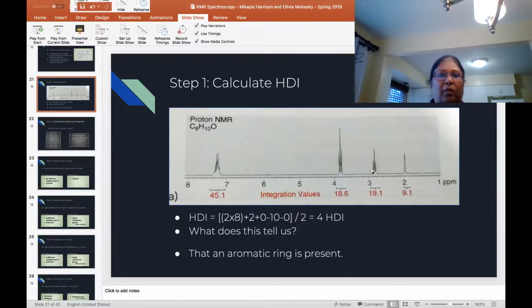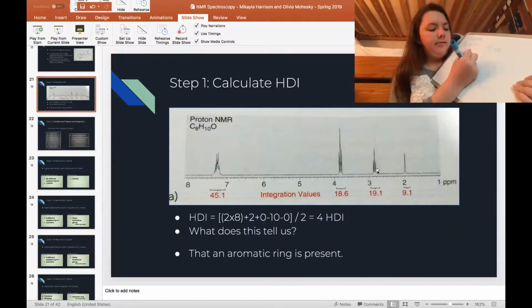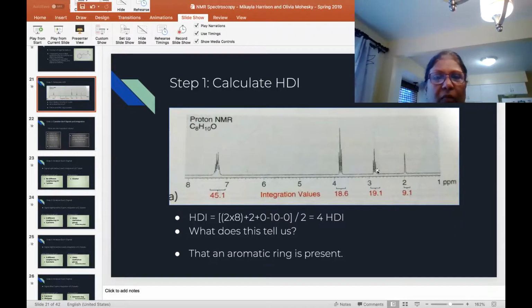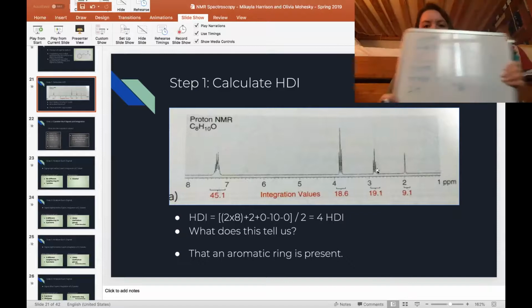Yep. Now, what do you think that is? Possibly a CH2, right? Mm-hmm. Yeah. So with that, what I would do is I would just draw out like CH. Man, this marker's running out. So I'm looking like, here's my fragment. This squiggly line just means it connects to something else. So I know that that's another methylene group over there.